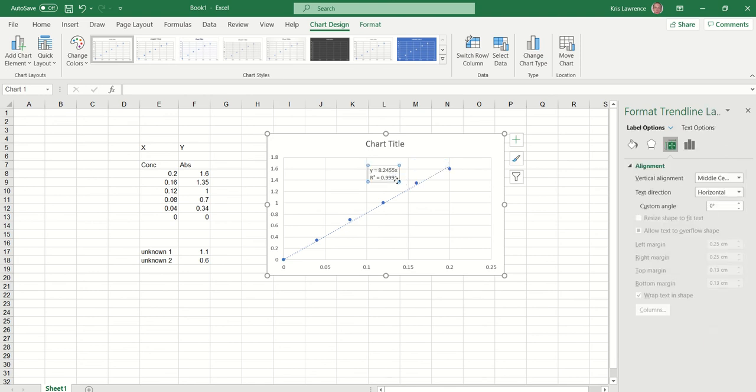Just to discuss the significance of these: the R-squared value basically tells you how close all of your points are to the line of best fit. The closer it is to one, the better. We can see that 0.999 means all my points are pretty much spot on that line. The lower that number, the less precise your points are with regard to the line of best fit. You can discuss that in an evaluation statement.